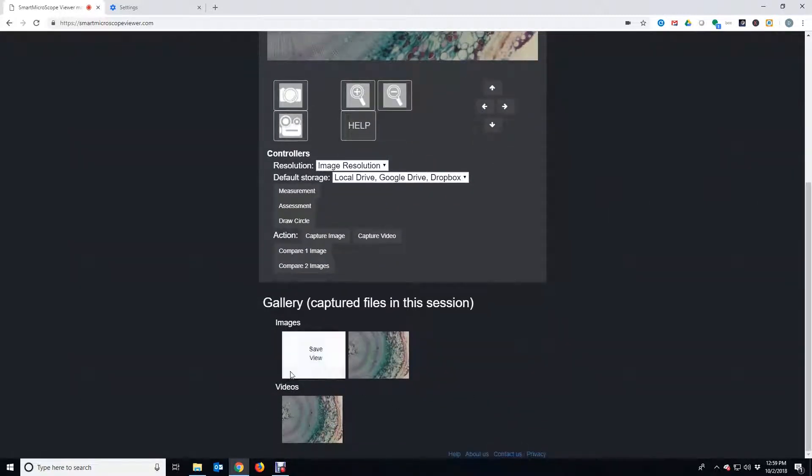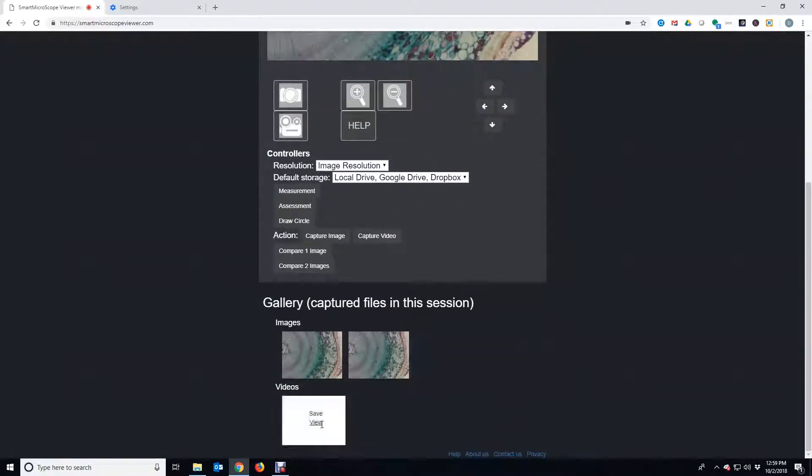Images and videos can be viewed in the gallery. You can view or save the gallery items.